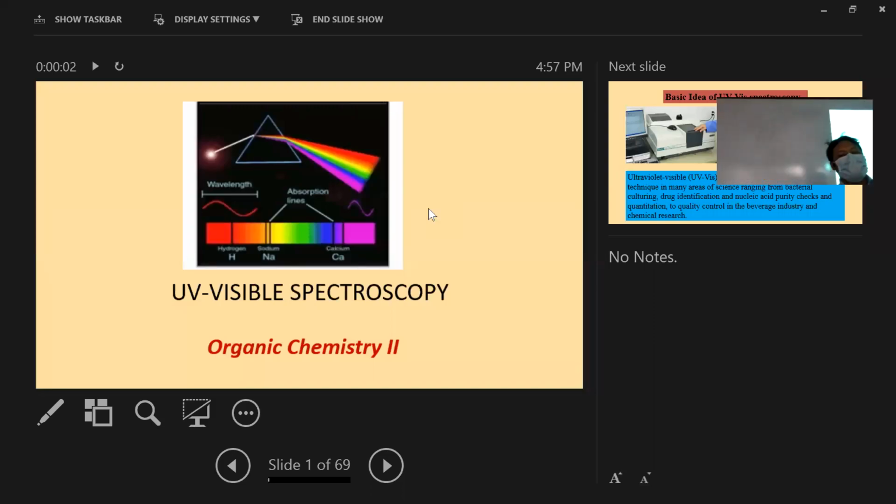Okay, I'm starting. So today we are going to start our study a little bit. In the last two classes, or in the last week, we have learned something about what we will be learning. But today we are going to learn something about UV spectroscopy.